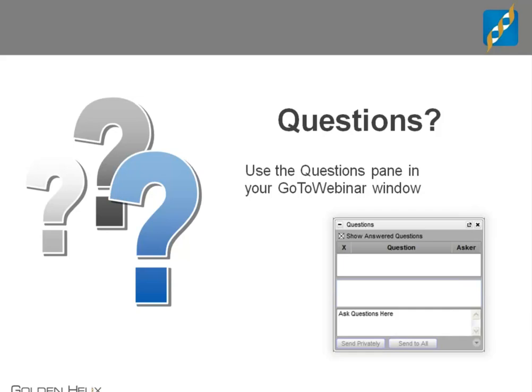So there are a few other questions here. A lot of them are similar to what we've already answered. One thing that is coming up here frequently is people would still like to see that demo that we skipped over. So I'll just take about 5 minutes now to walk through a brief demonstration of how this works in the software, and we'll go ahead and close with that.